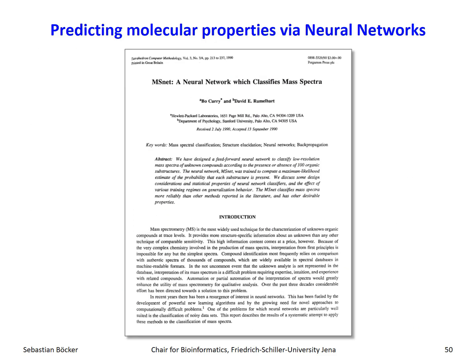And I already mentioned that in the very beginning. Neural networks are also not such a novel idea. They have been around for many, many years. In the 1980s, neural networks were the totally cool stuff. And then in the 1990s, people turned away and went to support vector machines. So these so-called experts in the 1990s would have probably told you, why are you using neural networks to predict a molecular fingerprint? That doesn't make sense. Use some cool machine learning, something gold, something Gucci to predict that, and not these neural networks. Everybody knows that they are not working very well.